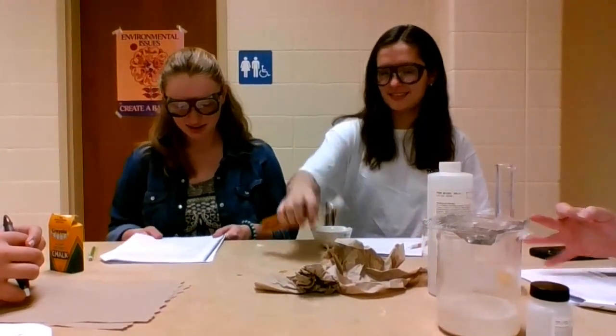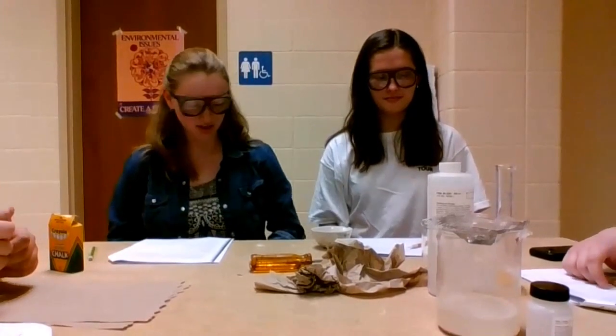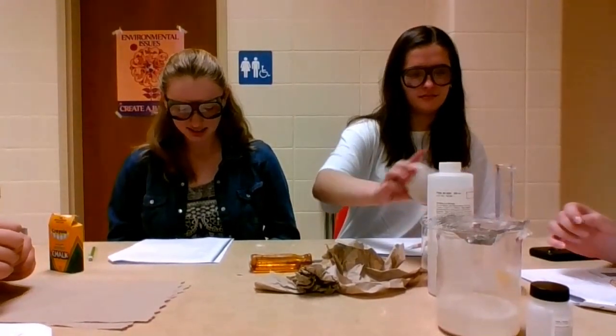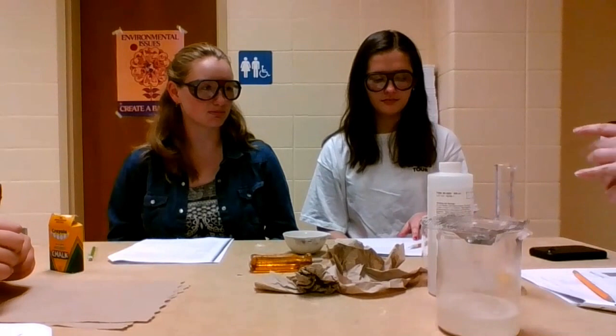Okay. Place the chalk in a small beaker. Where's number 1? Place the mossy zinc in the other small beaker. Should we have dried it first? It's okay, it's fine.